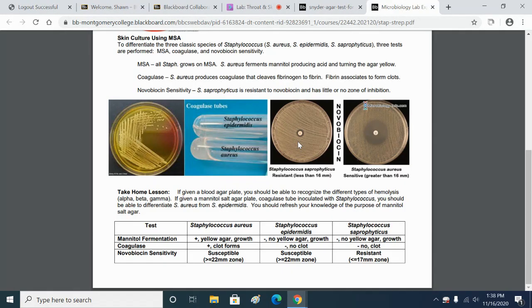Rachel, no guess? Brian? No, I could only think of the contamination thing. All right, so we're not contaminated. We have just one organism, but it's still giving conflicting results. So what could be a possible explanation why? What if the sample, not enough sample used? No, we've got plenty of sample, and it's pure. So why could our organism be giving conflicting results?